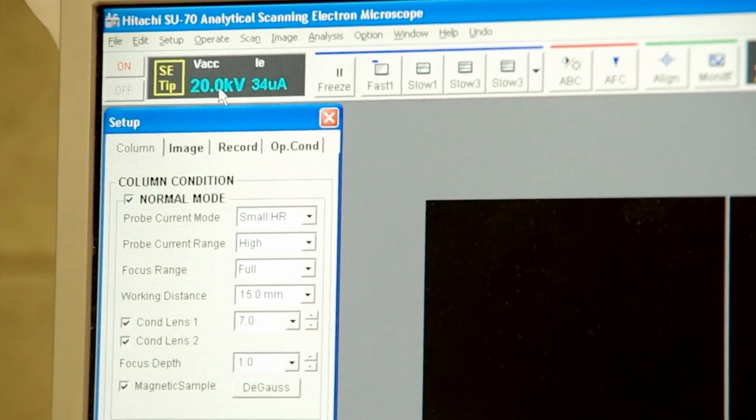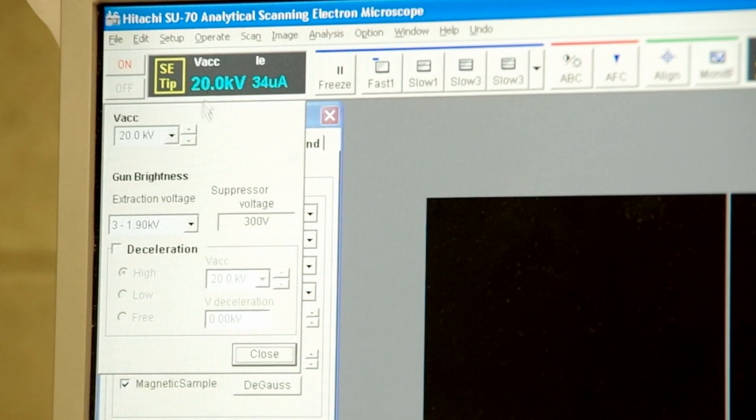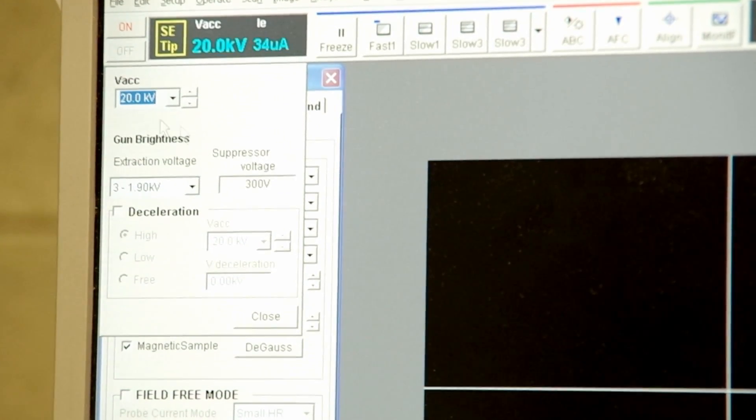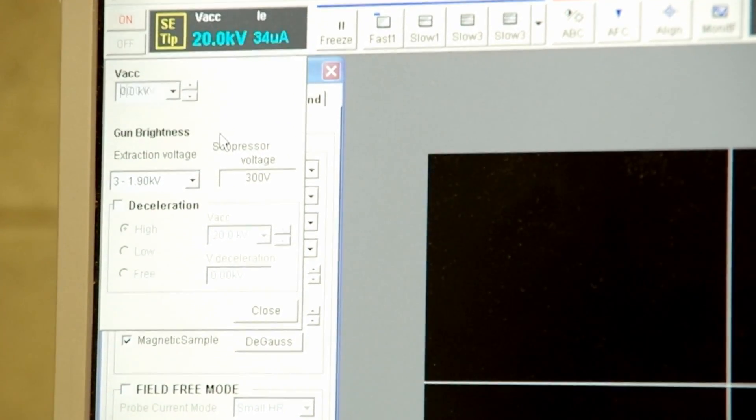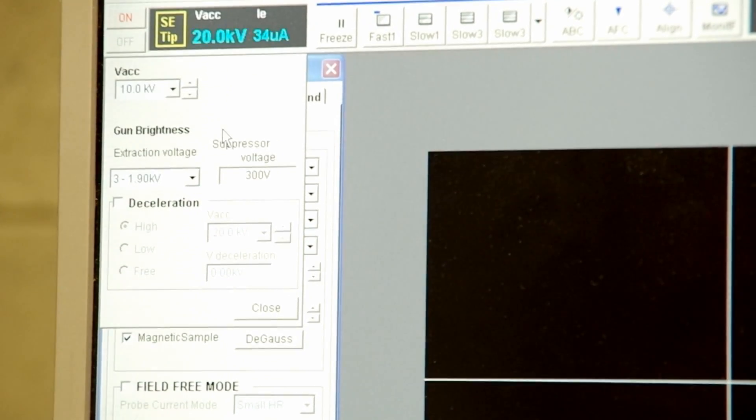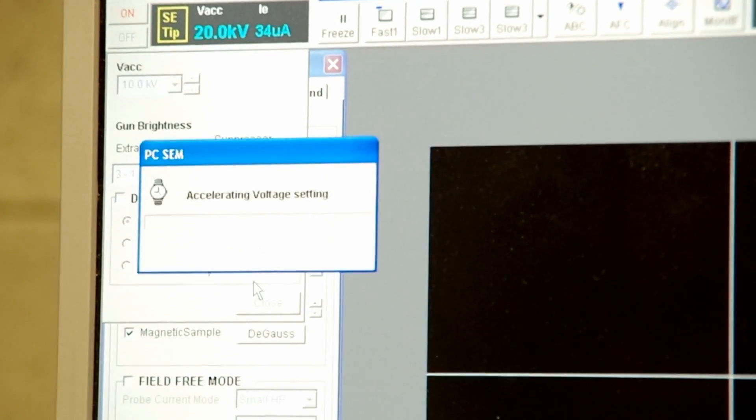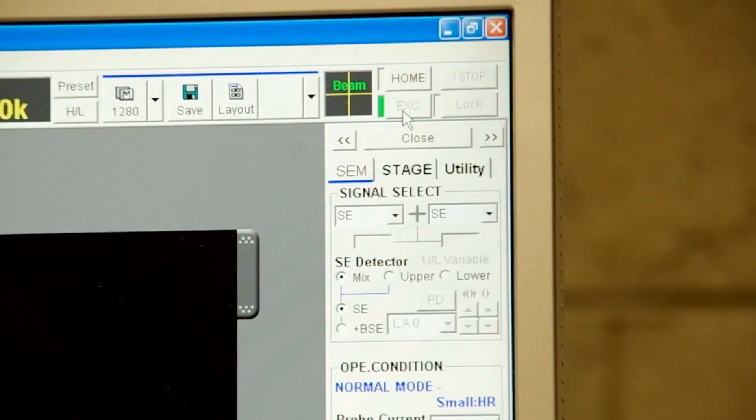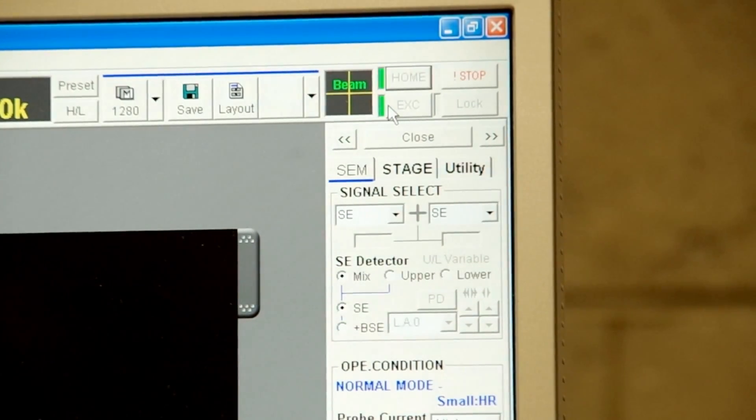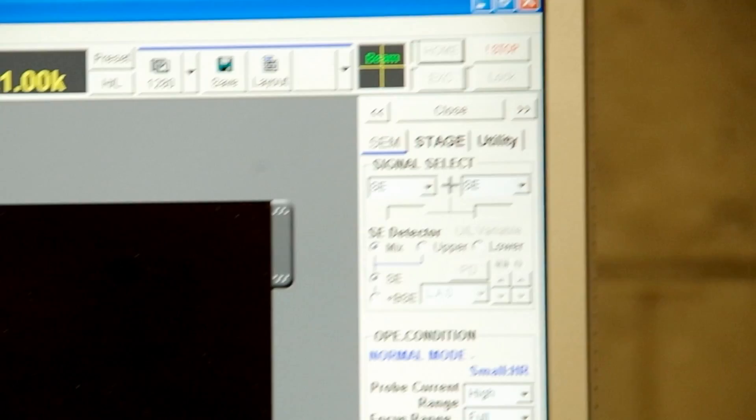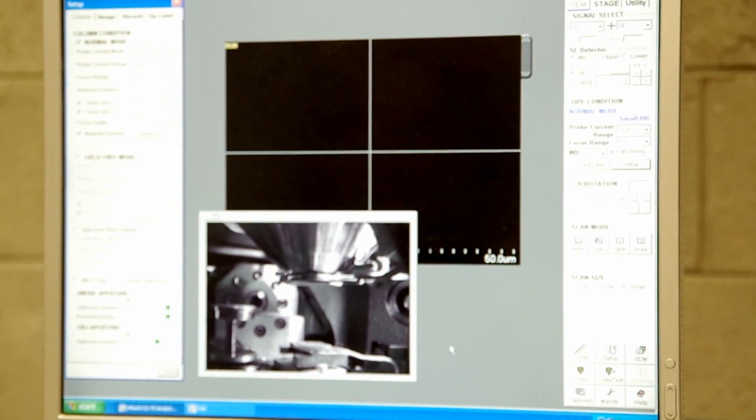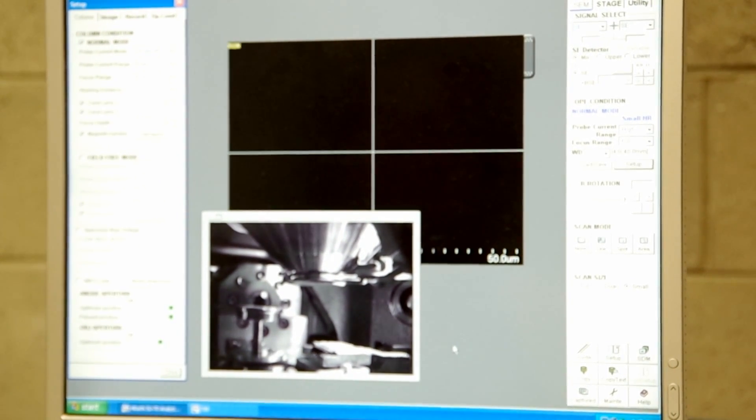The beam voltage is optimized. For gold coated L-glutamic acid, 10kV is used. The specimen is exchanged to home position. It gradually moves over to the center of the beam stream.